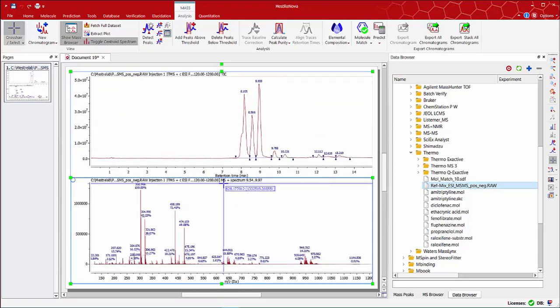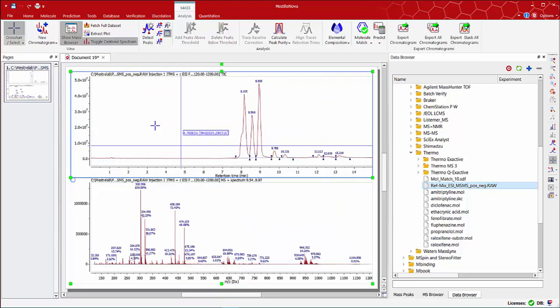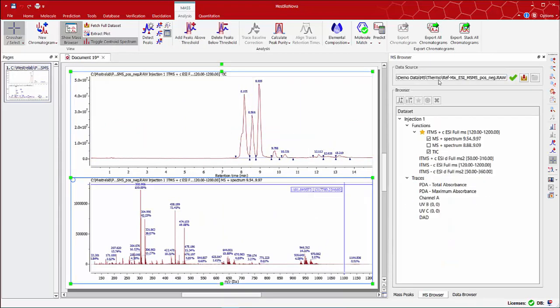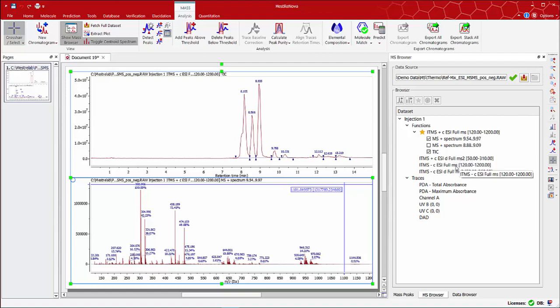Other components for this data set can be found using the Show Mass Browser tool. These will be displayed on the MS Browser panel. As you can see, you have positive MS and MS-MS traces as well as negative MS trace. There are also several UV traces.